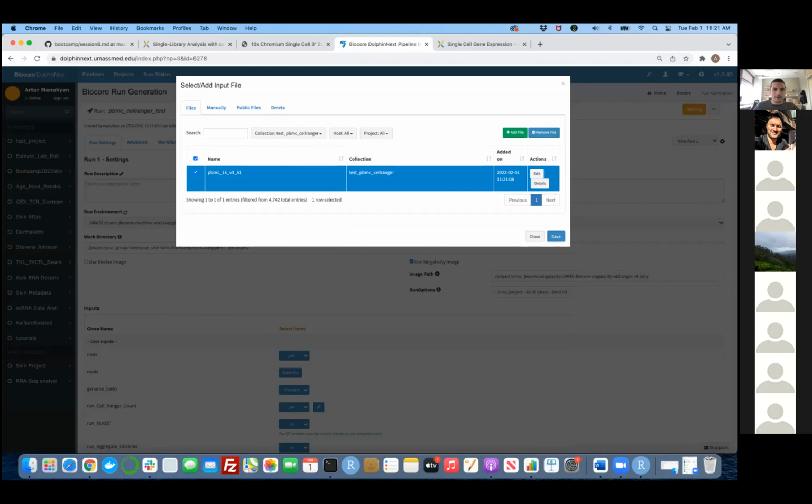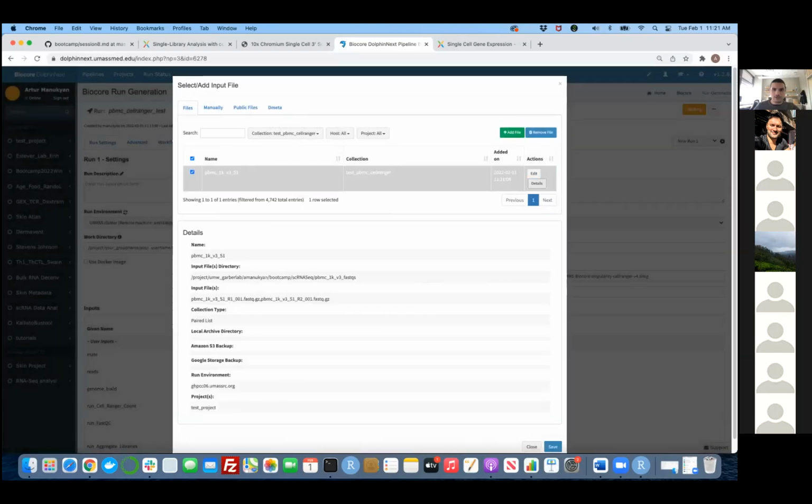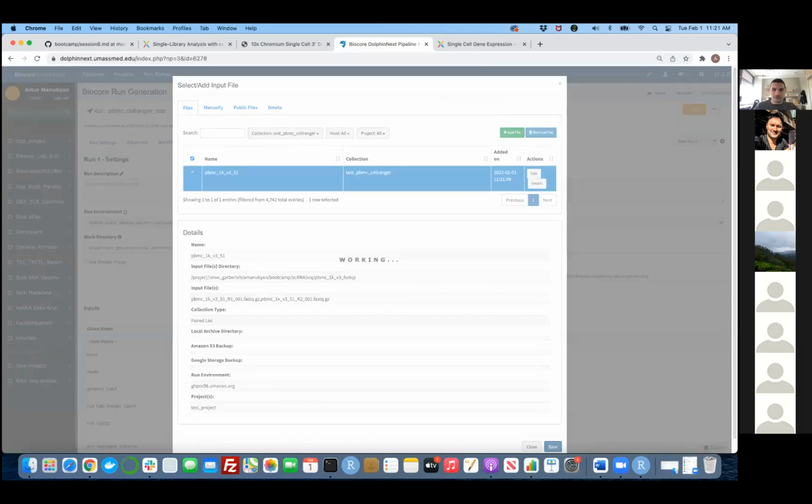Yeah, there you go. So I have a new collection. You have a sample over there. It's already set. And I have everything here. You can just click on the details and see if the path is right and everything is right.